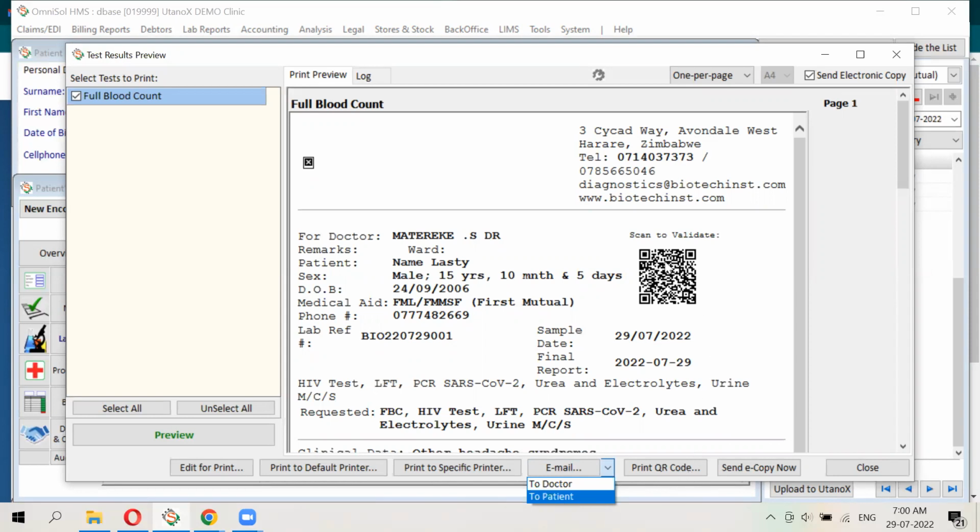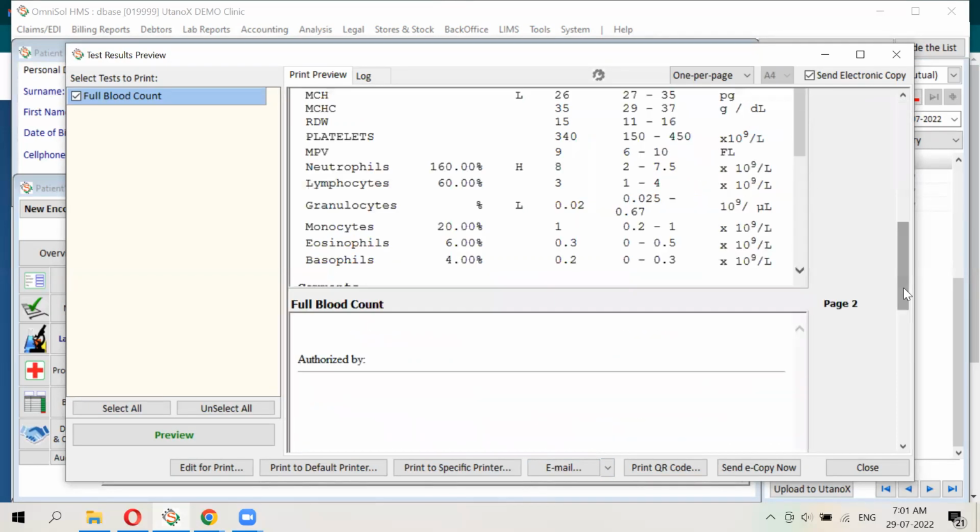And this is a QR code, which can immediately be scanned to get a validation of this specific result online. In fact, this platform is already used for validation of results worldwide, particularly with the COVID tests at airports and other points of entry. So this is a fully functioning system that's already been used for about a decade now, about 10 years.